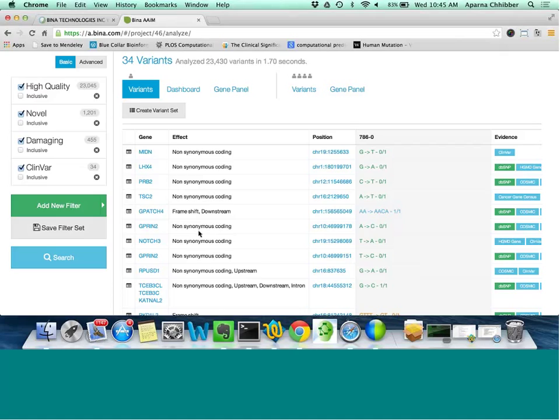There's a question about which annotation sources are included in the subscription. So all publicly available sources are included in the subscription by default. The only ones that require your own license right now are the BIOBASE databases: HGMD, PGMD, TRANSFAC, and Proteome. COSMIC as well has moved to a subscription model. Currently what we have in the evaluation version of the software is the free version of COSMIC. If you would like to use the most recent version of COSMIC, you'd have to get your own license for that as well.